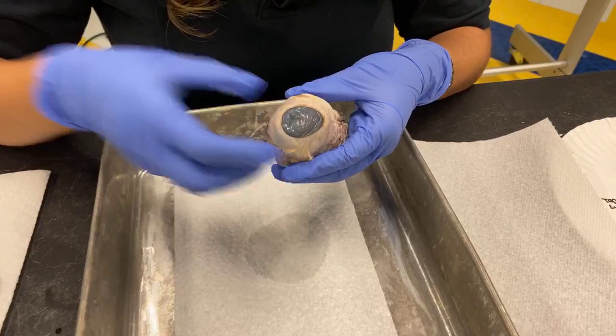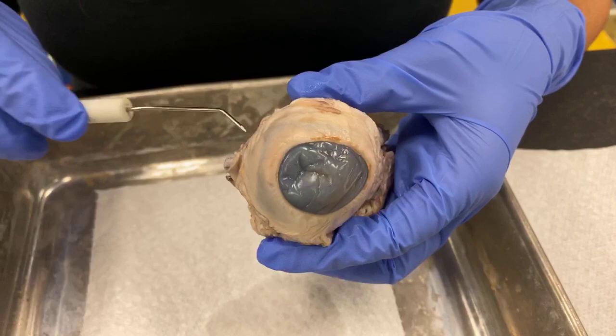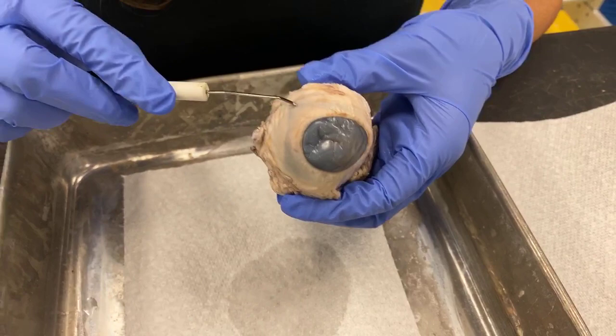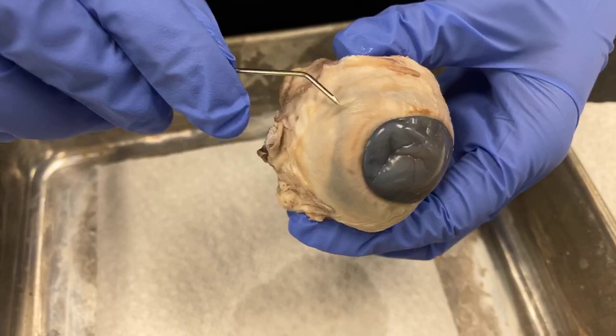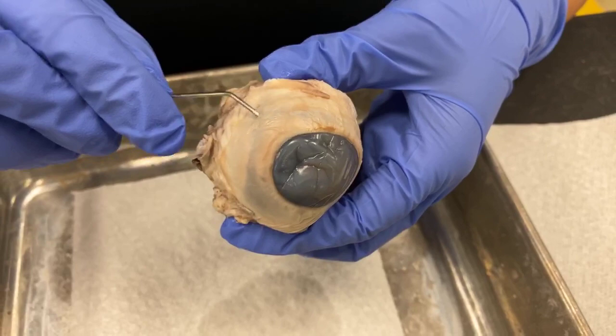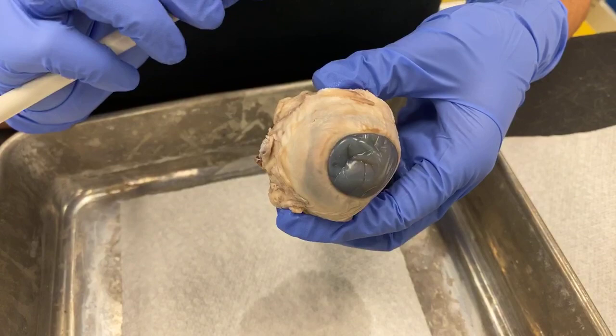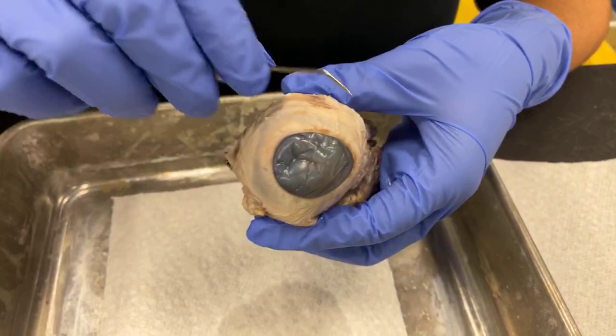So let's go to the front. We said this is the cornea. This white part, which looks kind of gray on this preserved eye, is the white of our eye — the sclera. If I run my probe along the edge here, you'll see there's a really thin lining called the conjunctiva. If you have allergies or ever get a pink eye infection, this is the lining that gets infected. Pink eye is also called conjunctivitis — that's when it gets red, inflamed, and might be itchy. The white part, the sclera, gives the eye its shape.